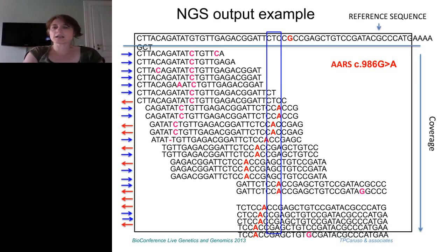So it's very clear to identify your mutation and possibly novel polymorphisms. You get all of the sequence reads aligned to your reference, and that is called depth or coverage of your sequence. So you see that there is a difference between the microarray, which gives you a FASTA file of your sequence, and this type of file that you get from next-gen sequencing, and that format is the FASTQ.